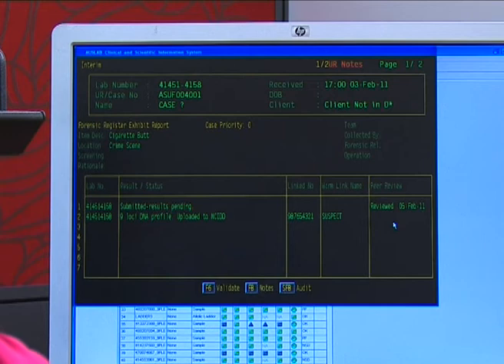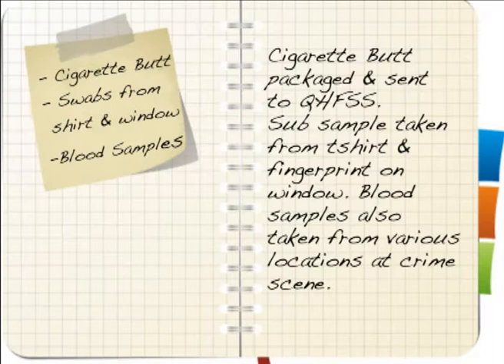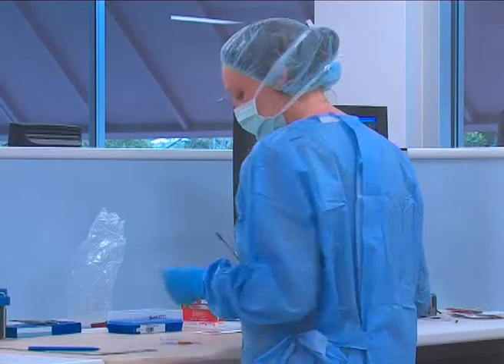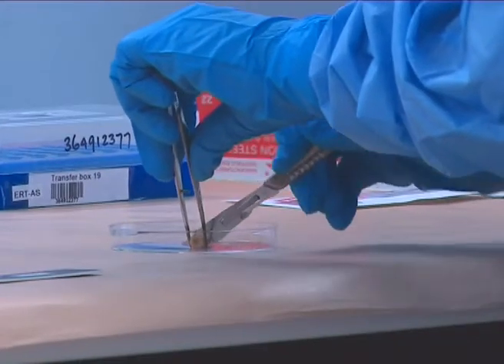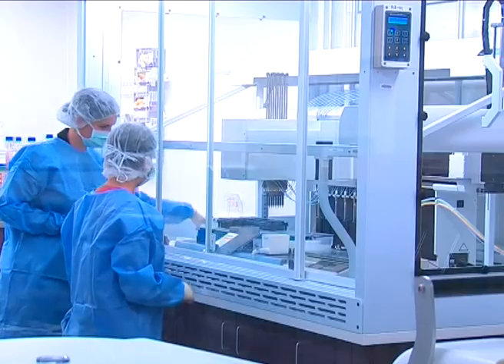What we're looking for is to ensure that the same DNA profile from the crime scene is matching against the person sample supplied for that particular case. We then verify whether they match or not, and a scientist will enter those results into our computer system. A peer reviewer will then come along and verify that those results are correct prior to sending them across. We obtained a DNA profile from the cigarette butt and that matched with the profile we obtained from the suspect's reference sample.